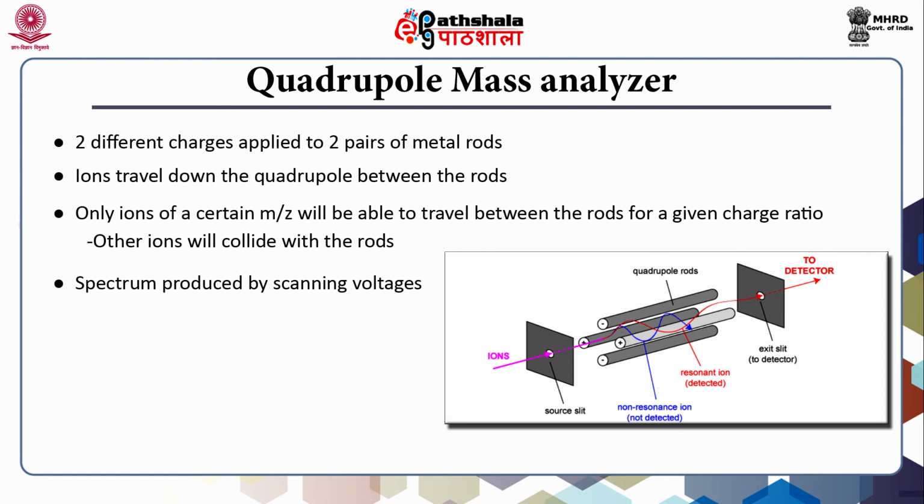It is different from the time of flight in the sense that here the ions are separated by voltage, while in TOF the ions are separated by difference in the time of flight. In a triple quadrupole instrument, 3 quadrupoles are added in tandem. The middle one is for the fragmentation, usually based on CID. The first and the third act as the mass analyzers. With triple quad, we can analyze various samples. We will talk about this later.